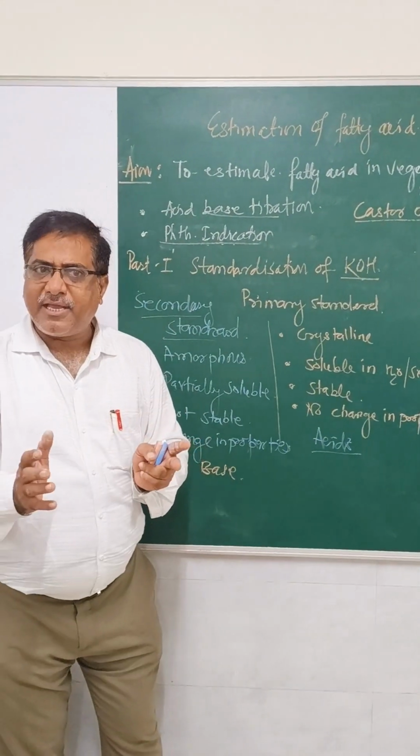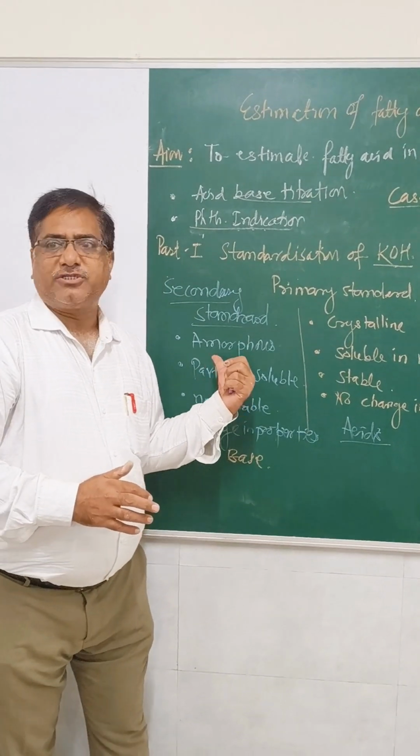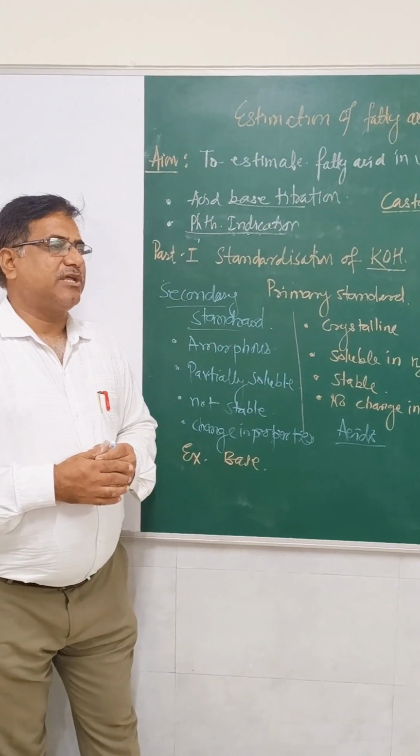If it is primary, we will believe in it. But if it is secondary, we may not, because its properties change, it is not stable, and that is why the concentration also goes low.